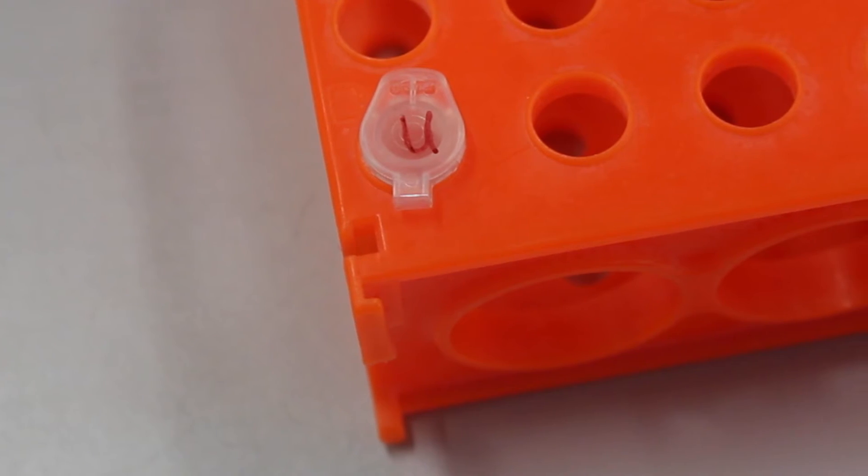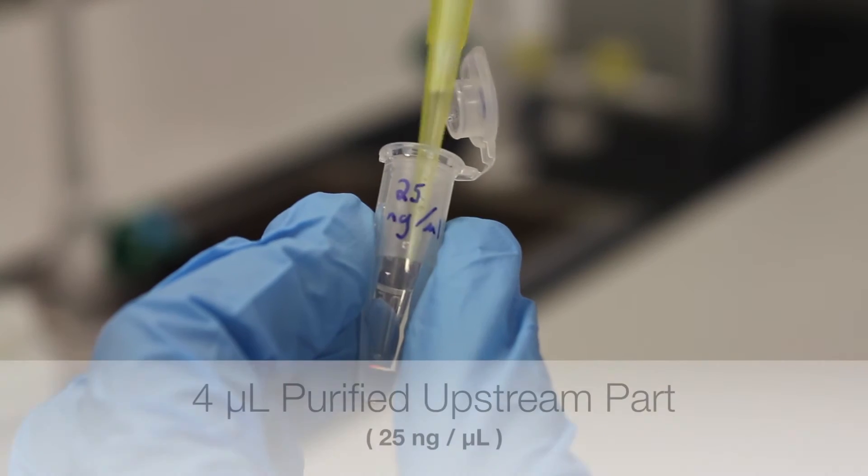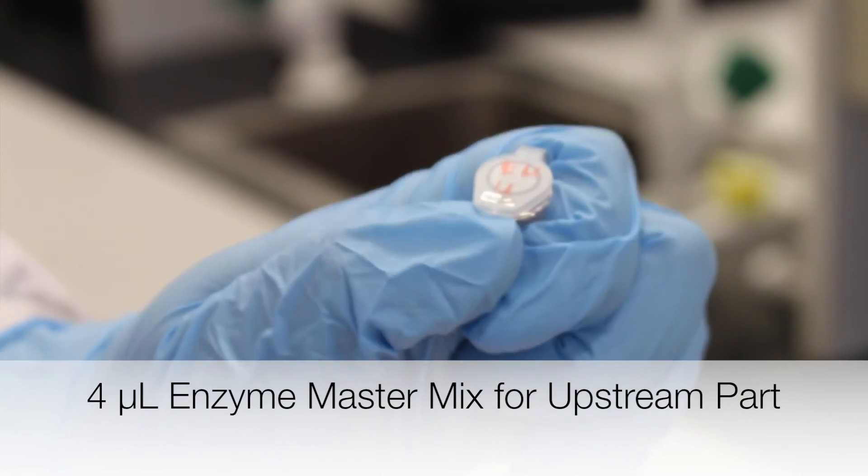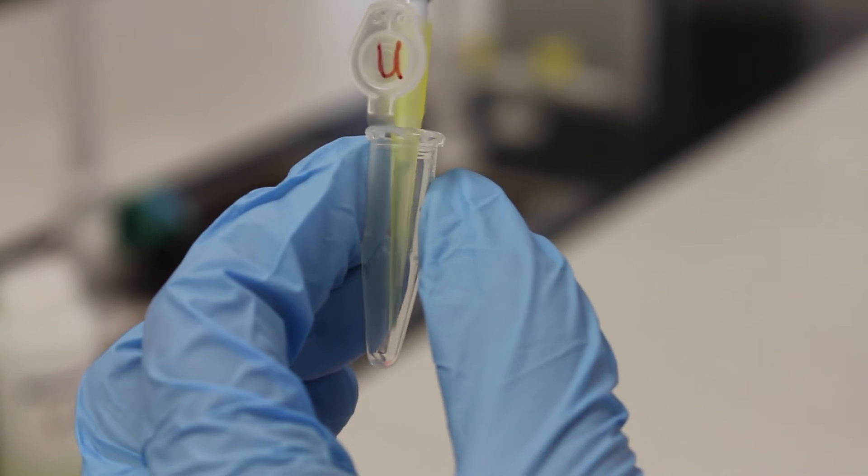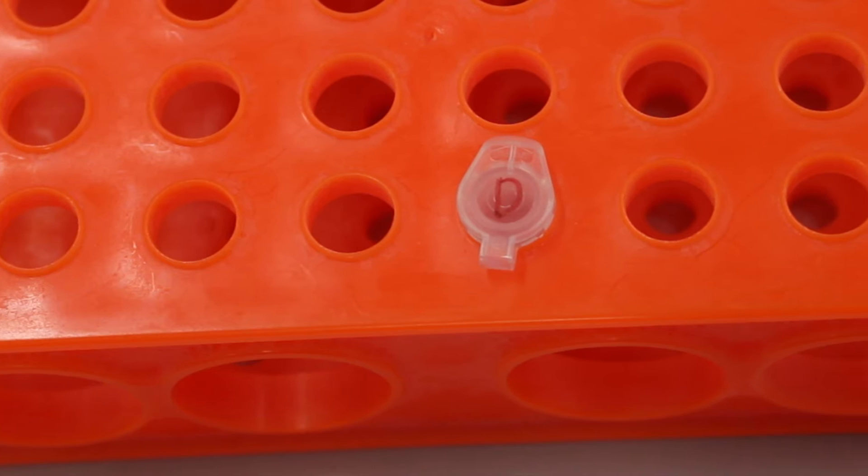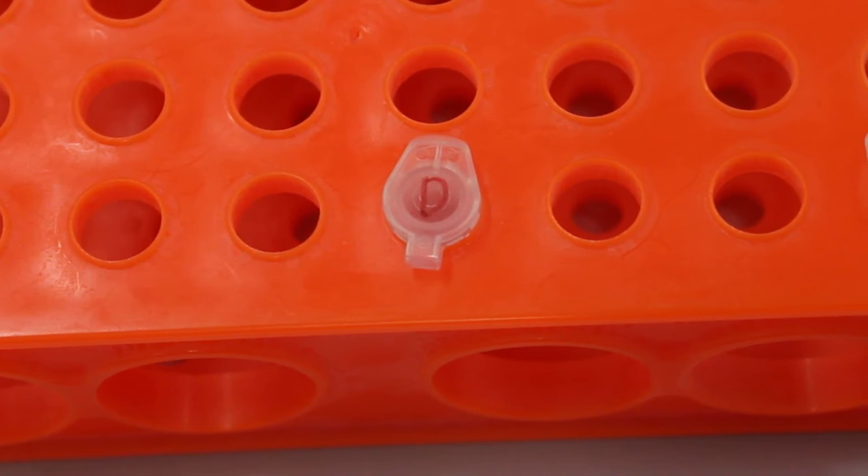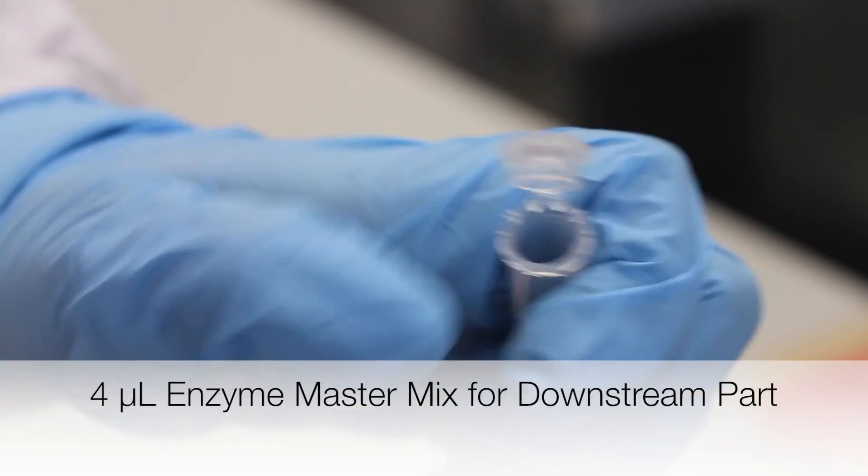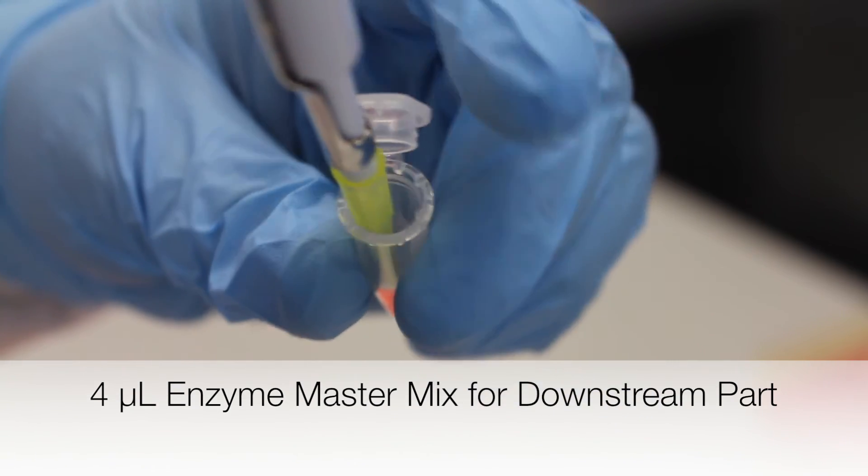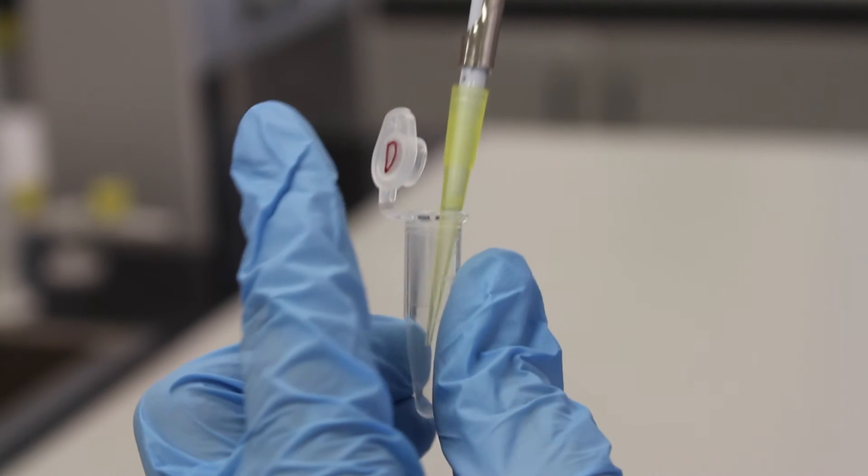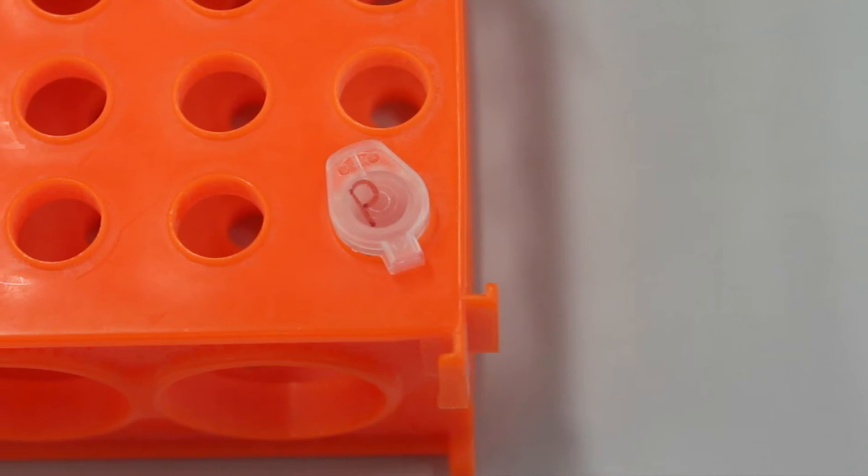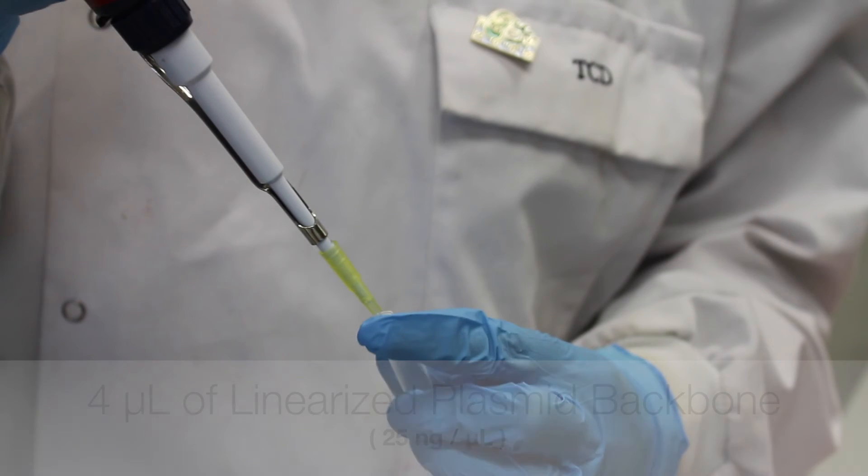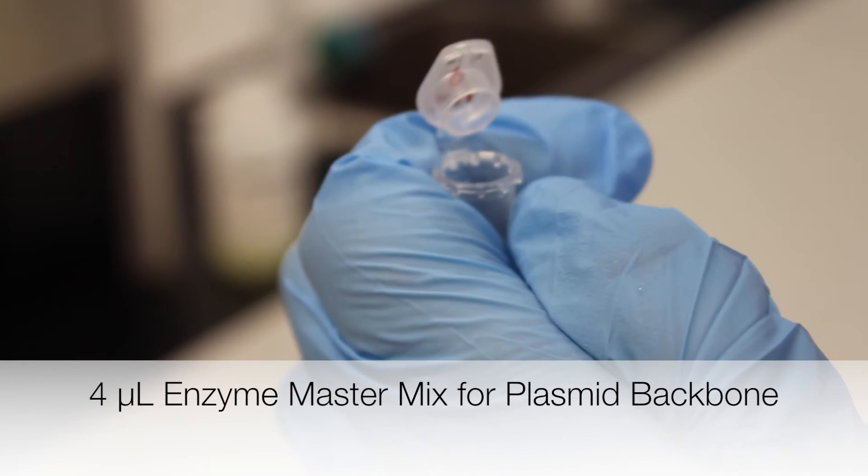To digest the upstream part, the following are added to a new Eppendorf tube: 4 microliters of the purified upstream part and 4 microliters of the enzyme master mix for the upstream part. To digest the downstream part, the following are added to a new Eppendorf tube: 4 microliters of the purified downstream part and 4 microliters of the enzyme master mix for the downstream part. To digest the plasmid backbone, the following are added to a new Eppendorf tube: 4 microliters of linearized plasmid backbone and 4 microliters of enzyme master mix for plasmid backbone.